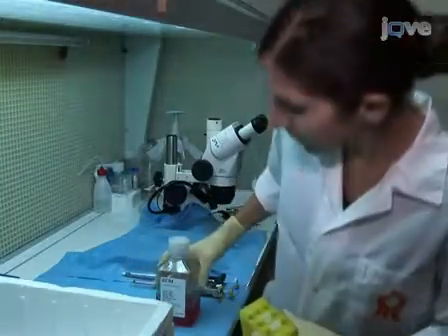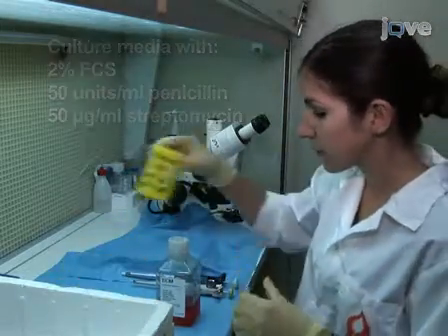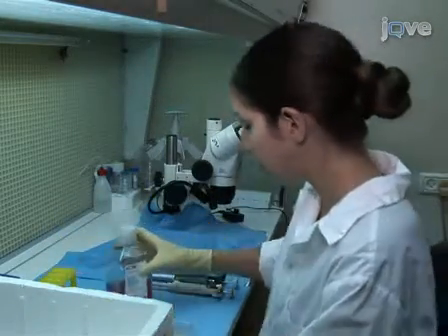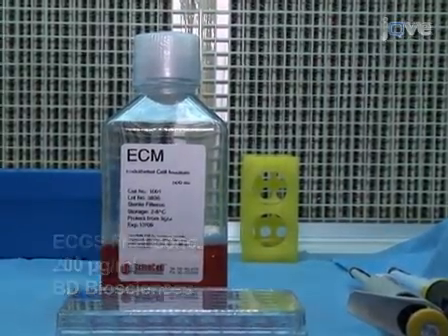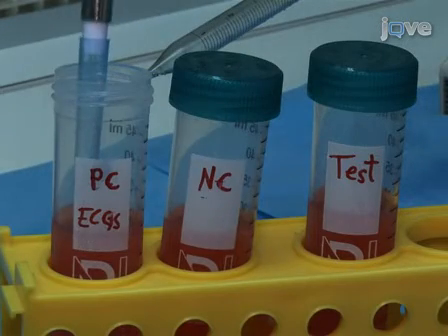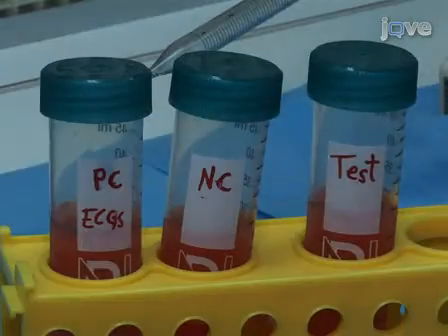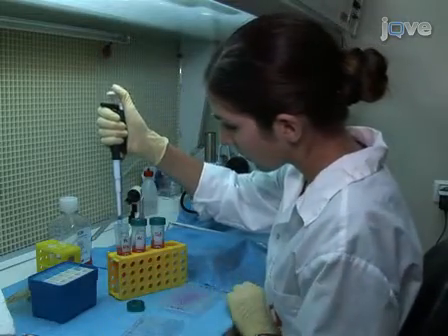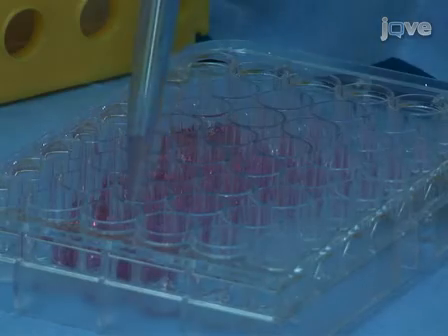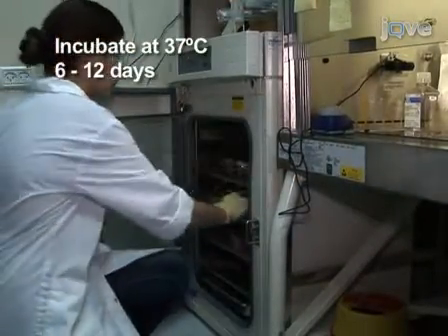To initiate the assay, pre-supplement previously prepared human endothelial serum-free medium with either the experimental material or endothelial cell growth supplement as a positive control. For a negative control, use medium alone. Add 500 microliters of the pre-supplemented medium to each well and incubate at 37 degrees Celsius for 6 to 12 days.